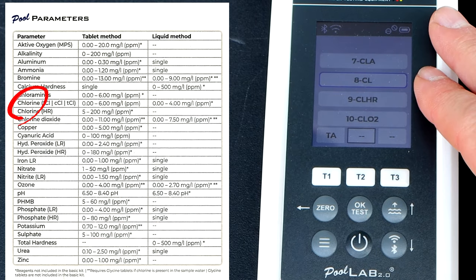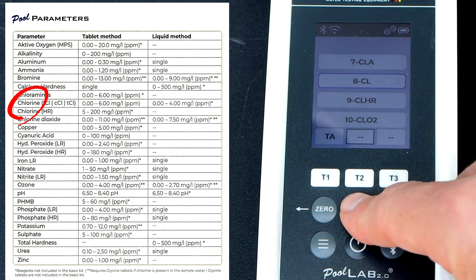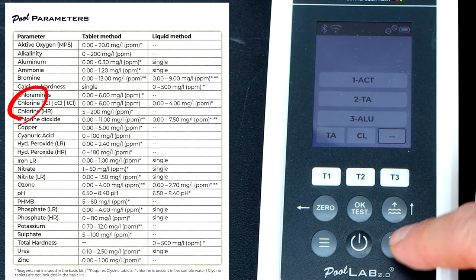Test two, I'll do the chlorine for the second test. And then the third test I'll do the pH.